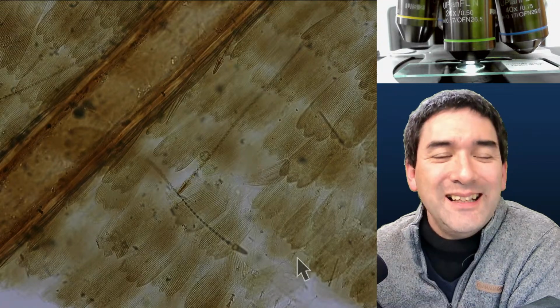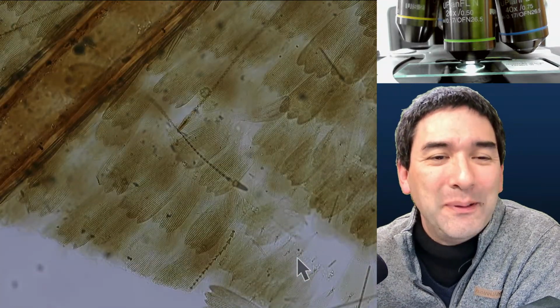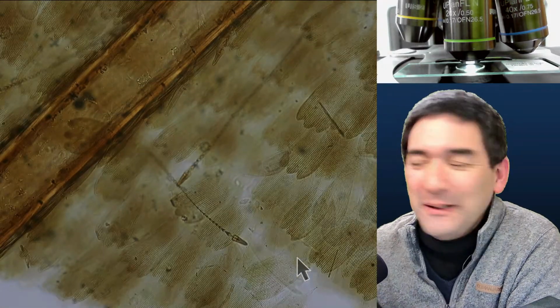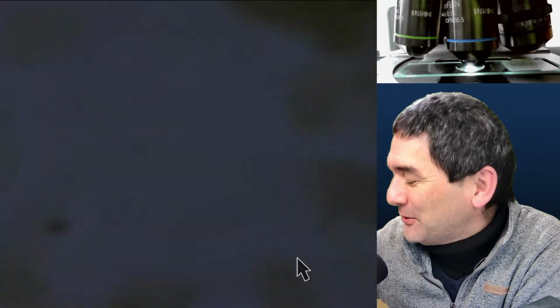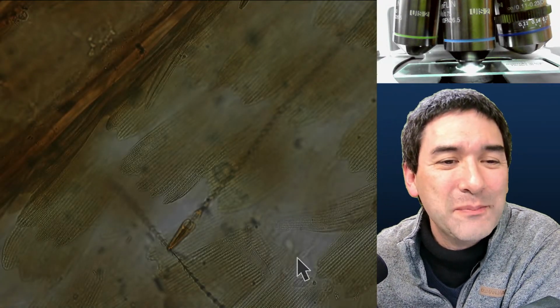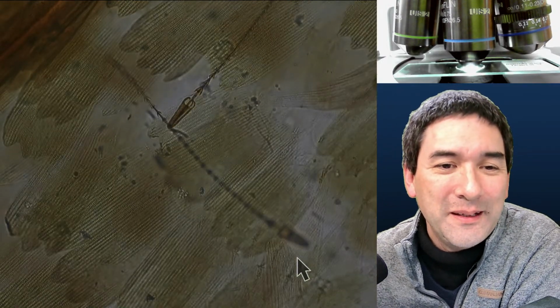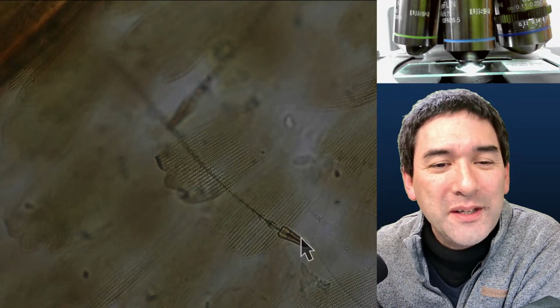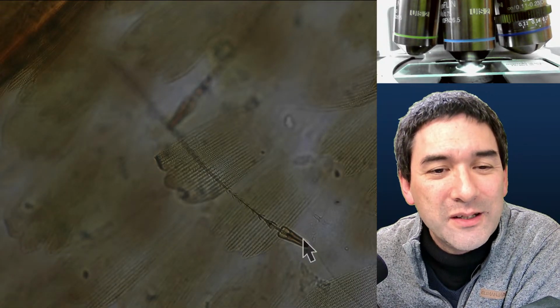Here, this is the sample that I really wanted to talk about as well. And I made a video of this as well. Look, this is something where I really need to go back a little bit in time. It's this mystery object here. What in the world could this be? Okay, look at this. It looks really strange.